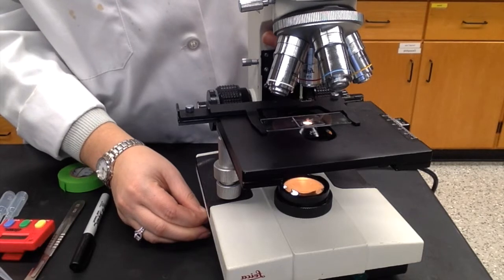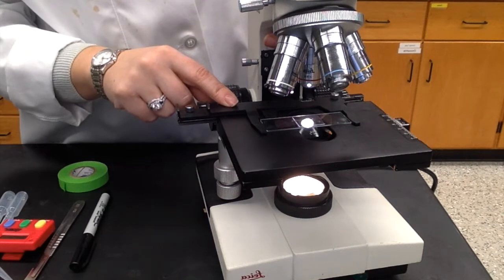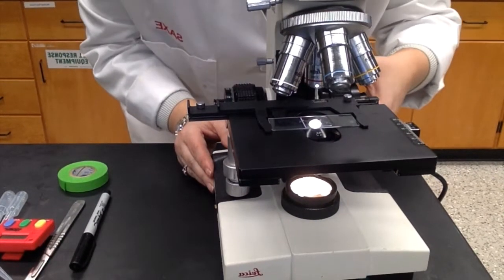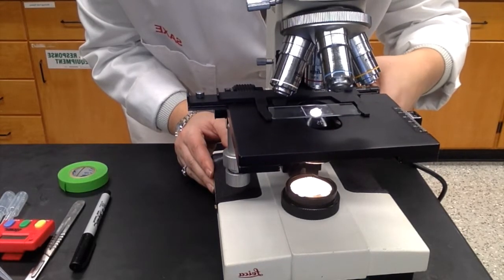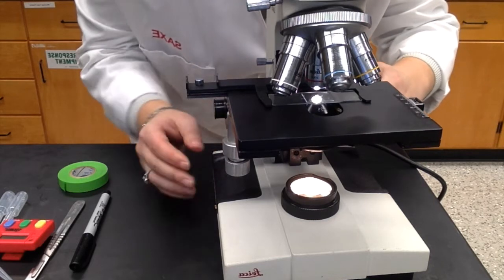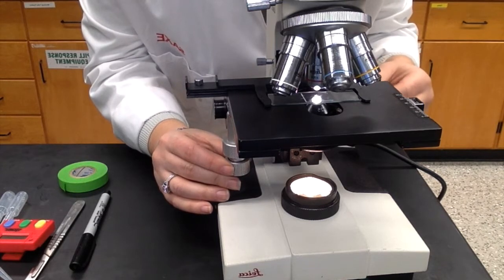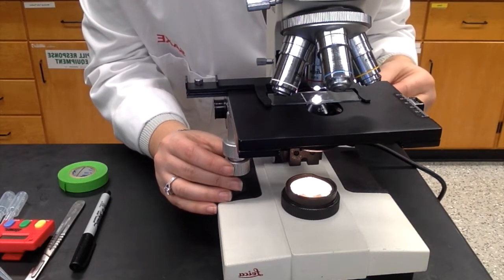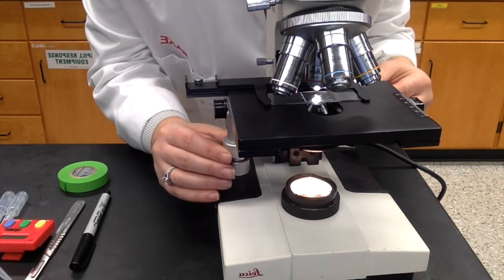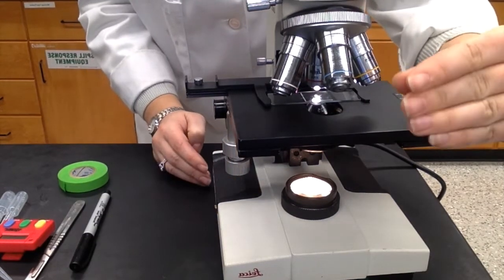Use the dial on the side of the microscope to adjust the amount of light, and begin with the stage as low as possible and the microscope on the scanning objective. Look through the microscope, raising the stage using the coarse adjustment focus until you start to see the worm come into view. You'll be looking under scanning power only, and then if you want to do more adjustments, you can use the fine focus. Figure out one segment of the worm only to watch, and you'll be looking at the contractions of this segment as it opens and closes.